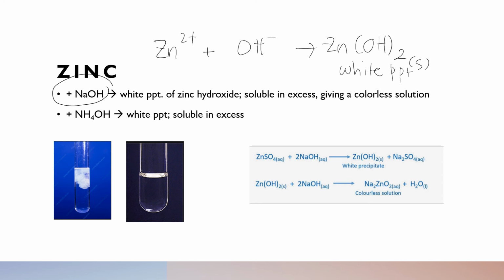When we add more NaOH until in excess, then the precipitate Zn(OH)2 will react with NaOH to form a colorless solution of Na2ZnO2, or sodium zincate, and water.